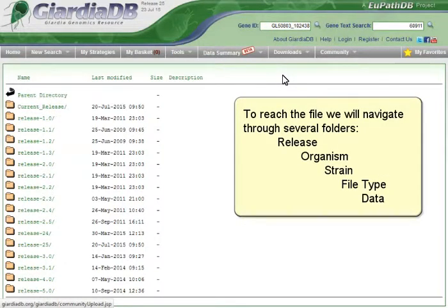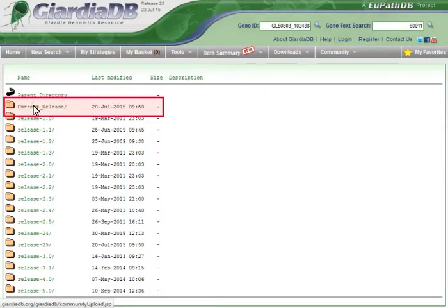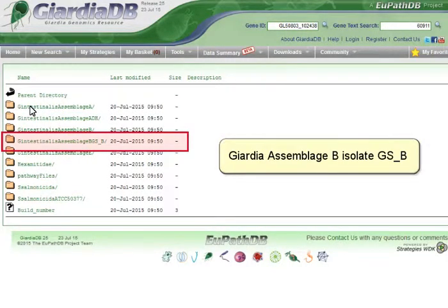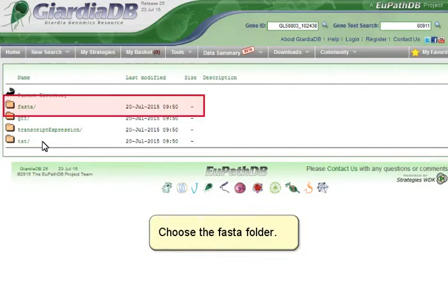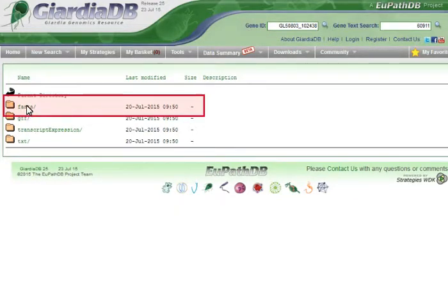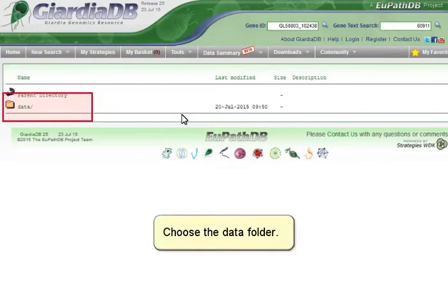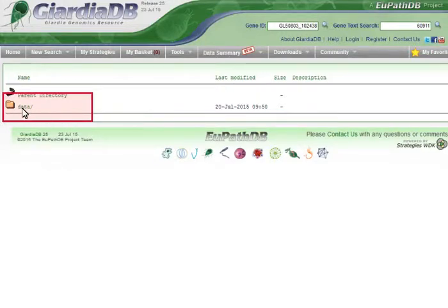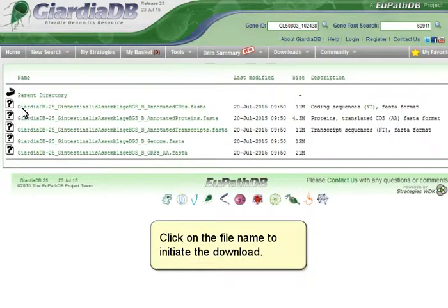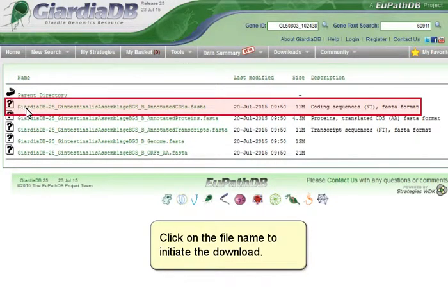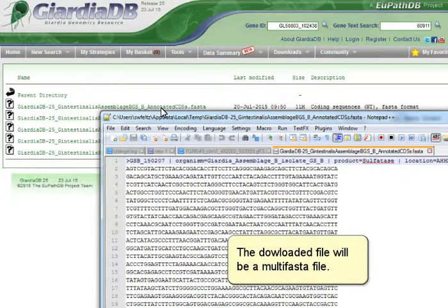To reach the file, we will navigate through several folders: Release, Organism, Strain, File Type, and Data. Select Giardia Assemblage B Isolate GSB, then choose the FASTA folder, then the Data folder. Click on the file name to initiate the download. The downloaded file will be a multi-FASTA file.